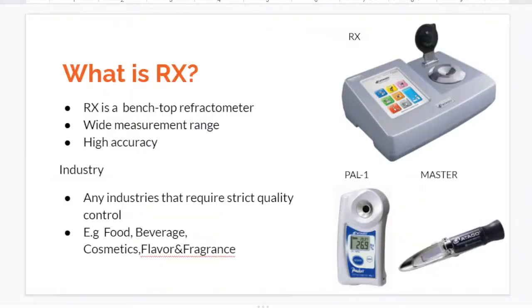So what is Rx? Rx is a benchtop refractometer. If you compare it with PAL-1 or MASTER series, which are digital and analog pocket-style and handheld-style refractometers, Rx has a wider measurement range and higher accuracy. So if PAL or MASTER are for quick and easy use, Rx series are more for precise or strict quality control.